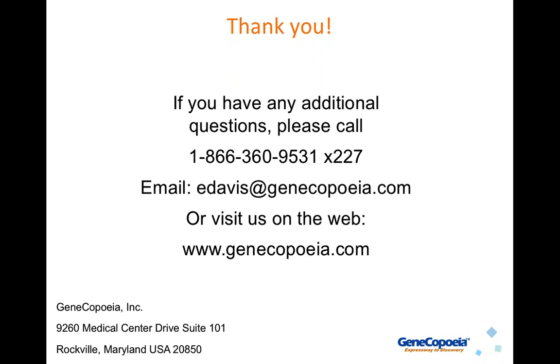Okay, in terms of CRISPR, if we knock out a gene, then should we go for HR or NHEJ? Again, I already kind of answered that question. It depends. NHEJ occurs at higher frequency than HR, but HR gives you the benefit of selection usually.